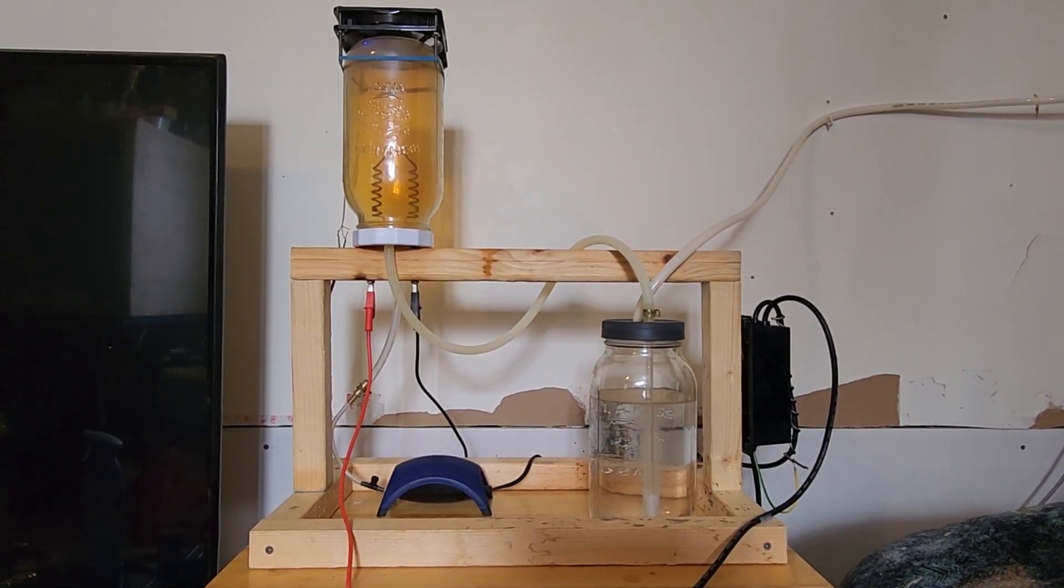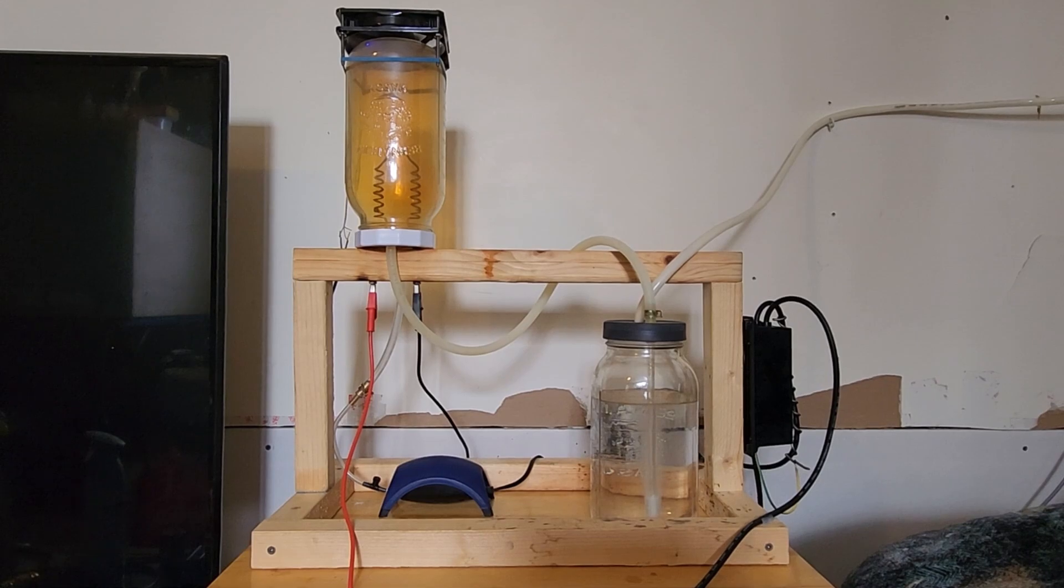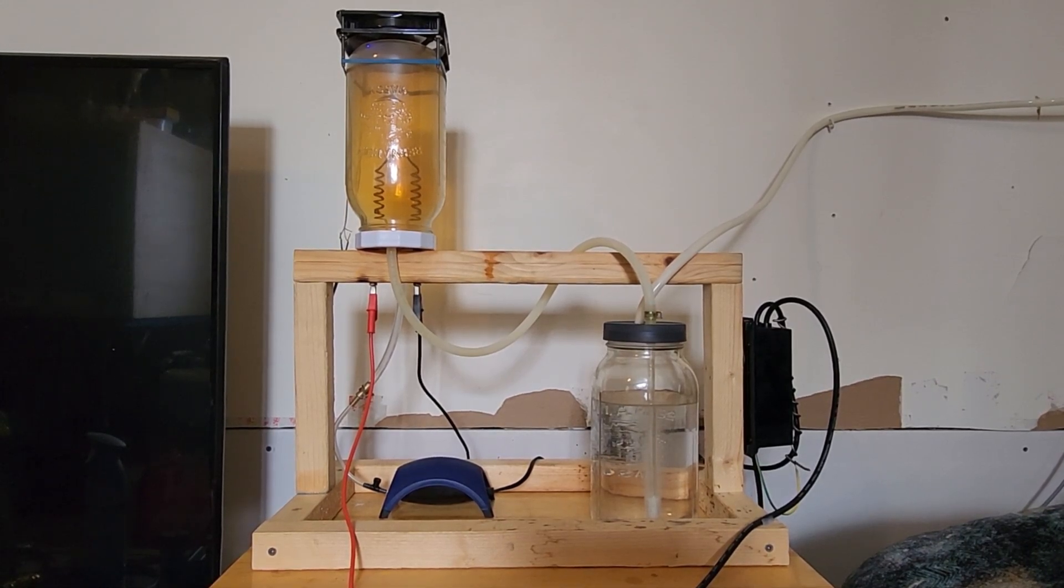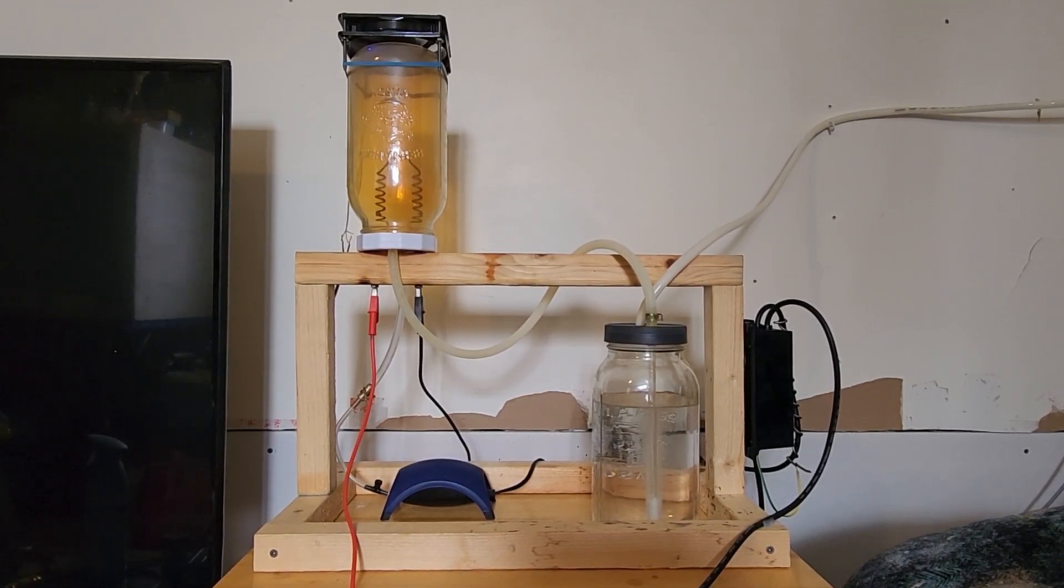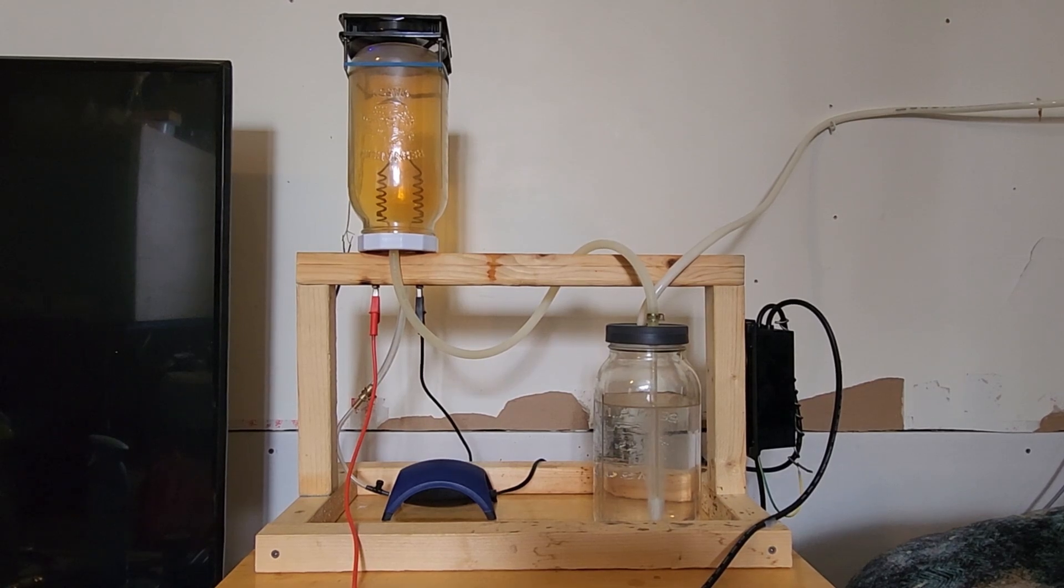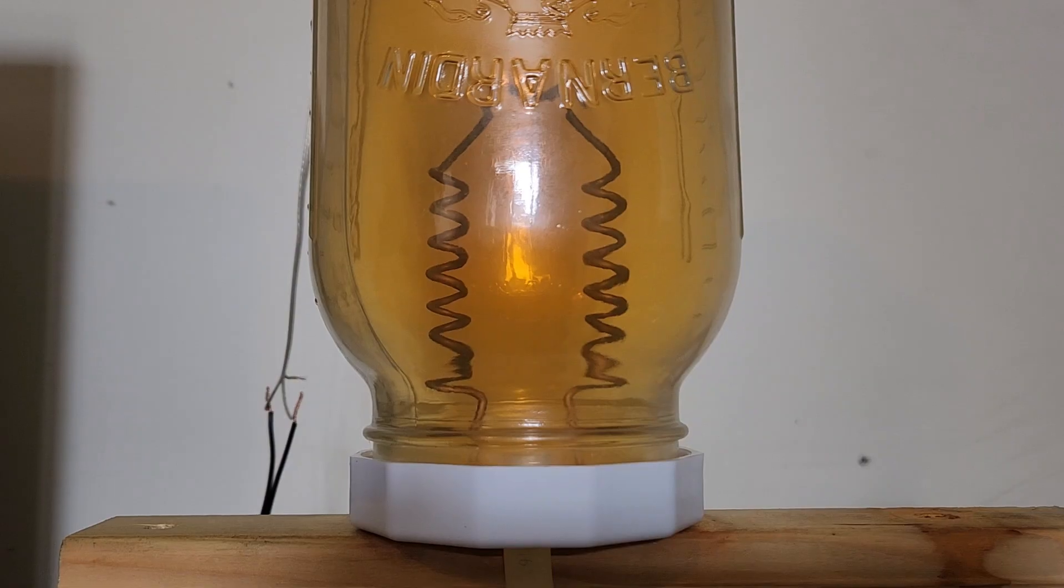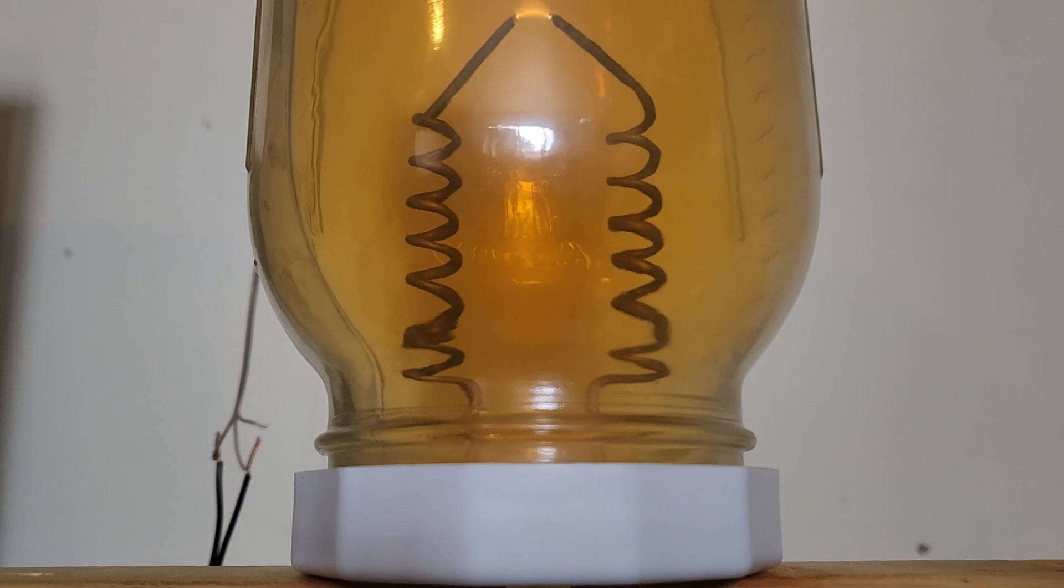Surprisingly, this method produces just as much nitrogen dioxide as the Jacob's ladder method. Also, for added safety, a computer fan was added to keep things cool. Let's take a look. This is the new simple arc system consisting of two coiled copper rods.